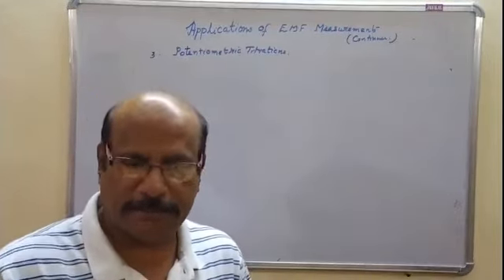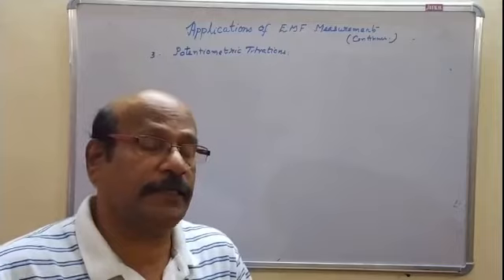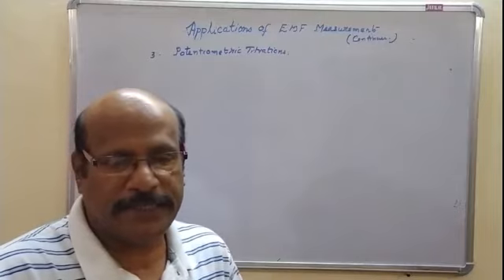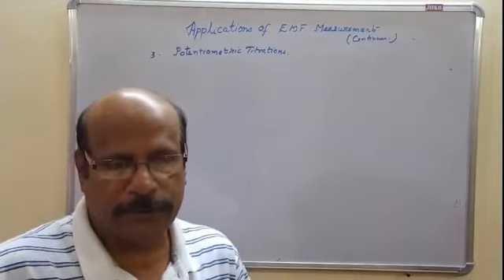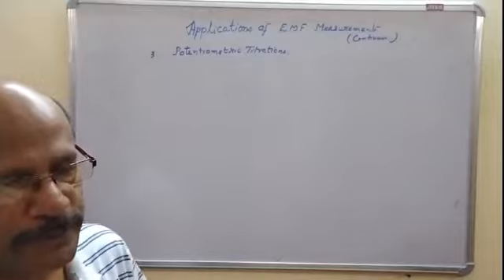so as to form a complete cell, and the EMF of the cell is measured. Actually, the change in potential around the indicator electrode is measured in the form of the EMF of a cell connecting the indicator electrode to a saturated calomel electrode, and it is measured potentiometrically.